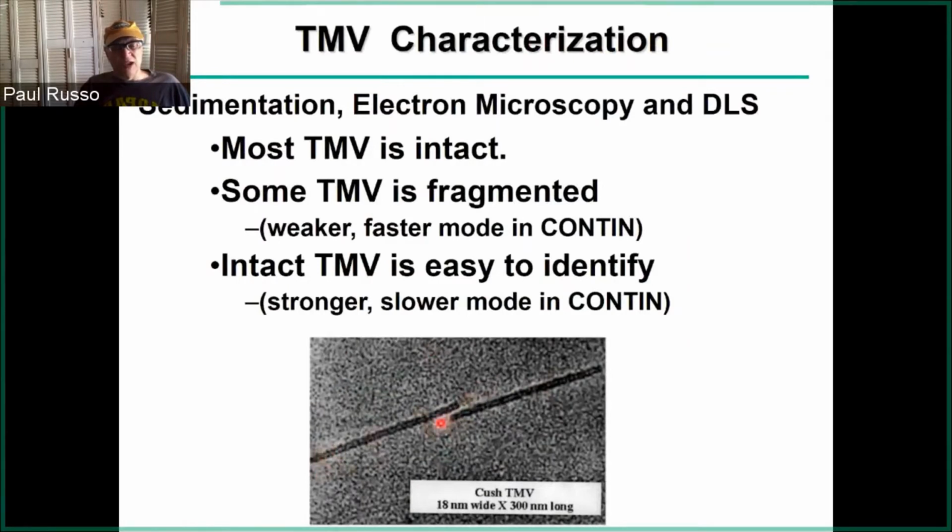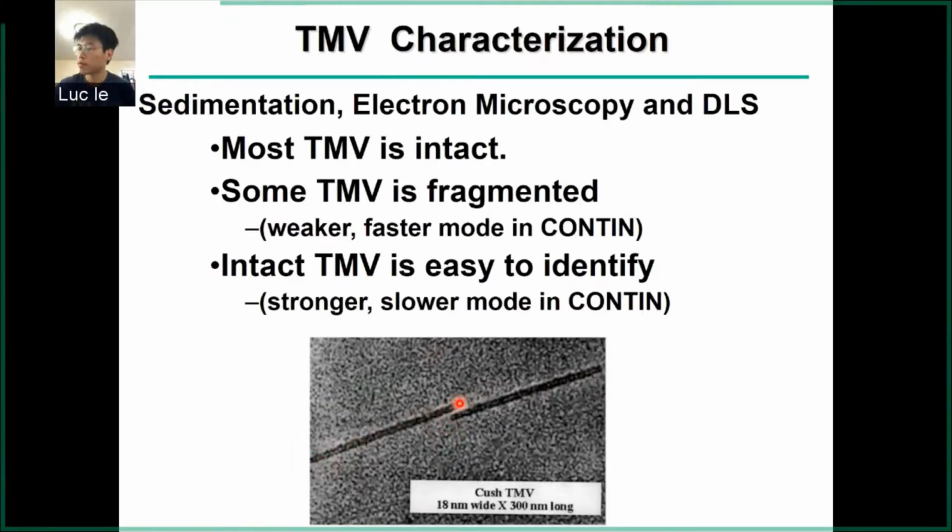So Zen, you would love to have these particles. Yeah, how consistent they are. They look just so perfect. Perfect geometry. They are wonderful. It's nature made. The only problem is that they break rather easily, but we can get you lots of images of these. That might be a good thing for your system to test. It's kind of the same size lengthwise, similar width, a little narrower probably. And we can get you lots of pictures of these in the literature, but I think we still have some of this stuff. We can get more pictures of it.